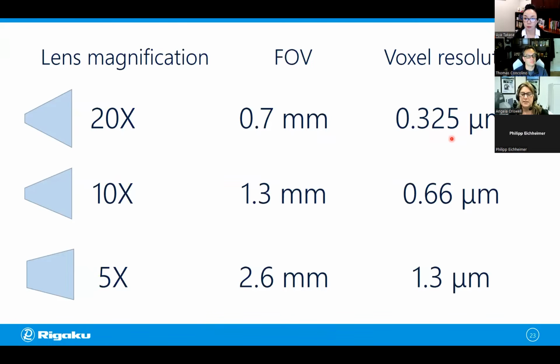And the next question, of course, you're going to ask is, well, is that process hard? And it turns out it's not. It just takes a few seconds. So you physically remove the lens, put the next one on, and then you run an automated calibration procedure. It takes 6 minutes, and then you're ready to collect data.